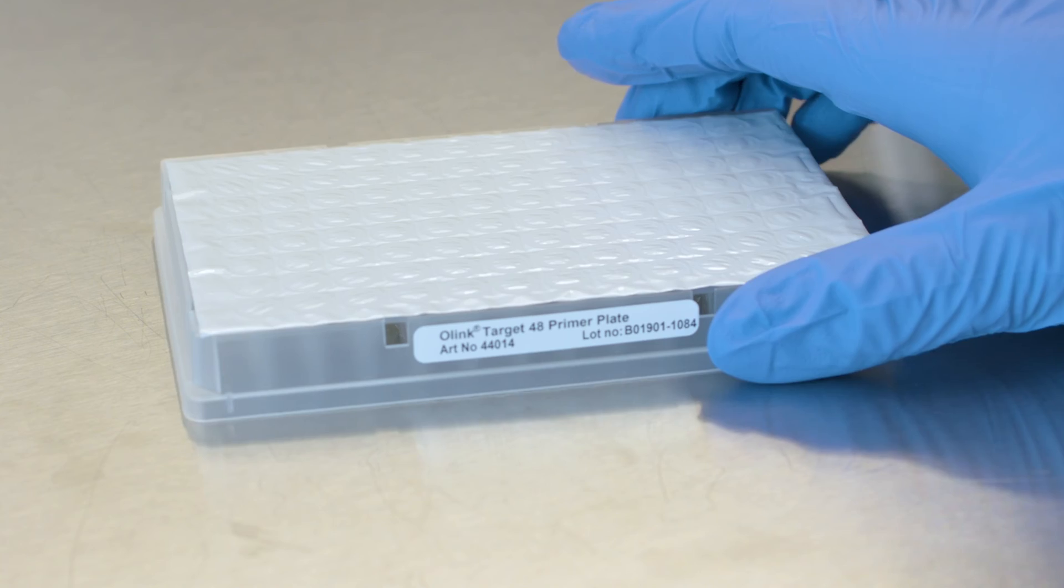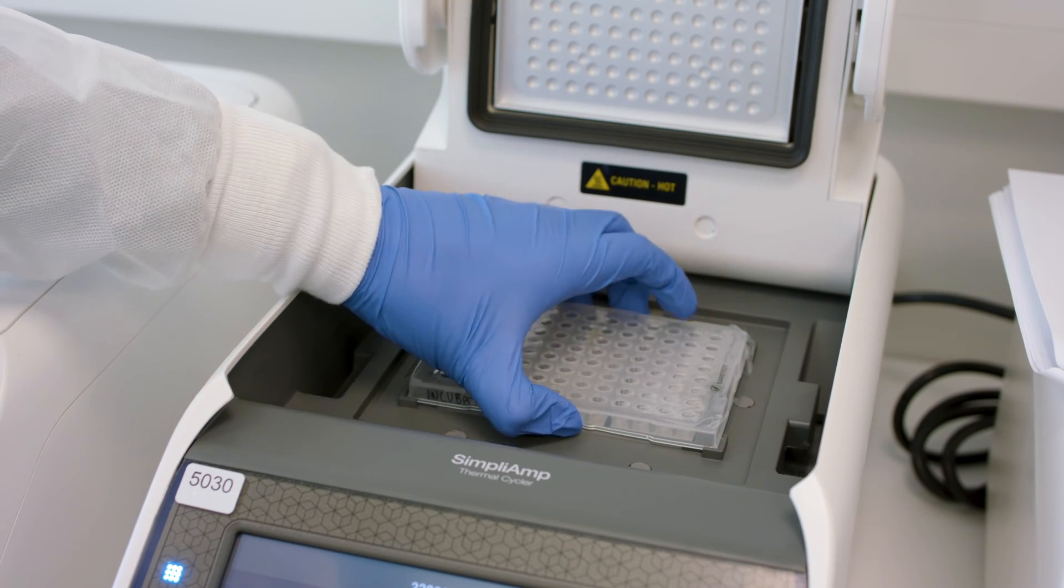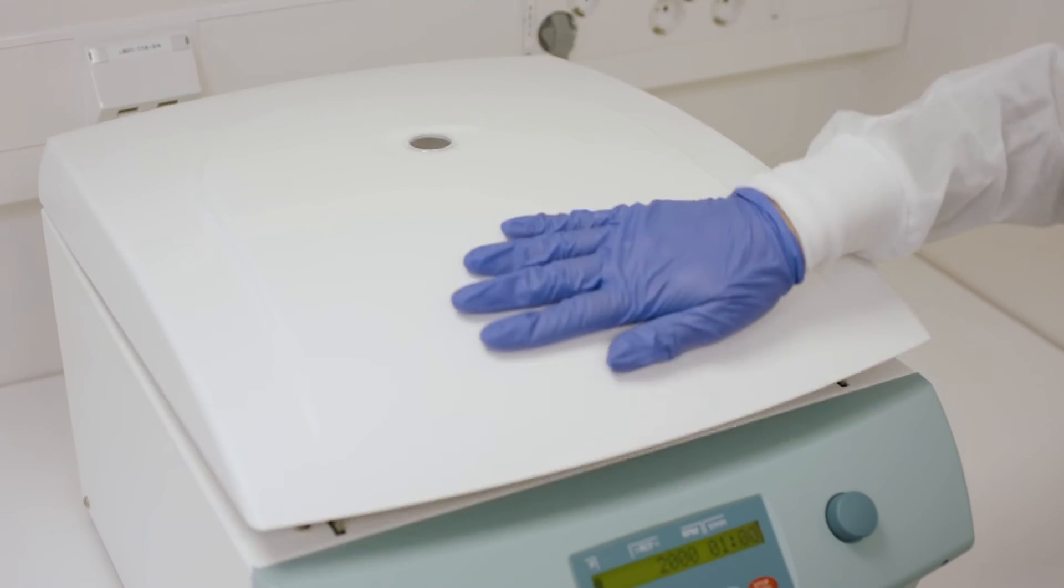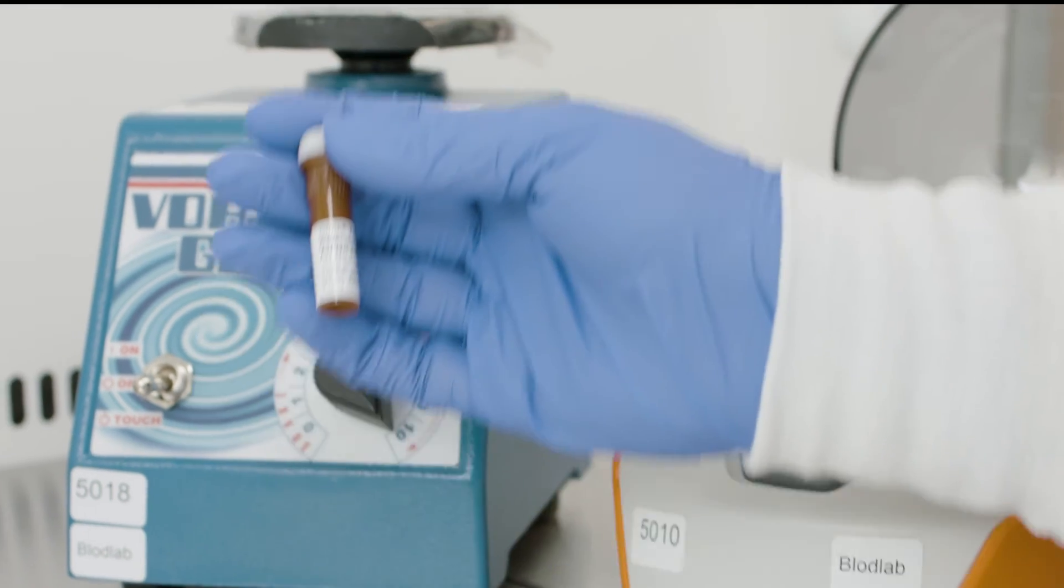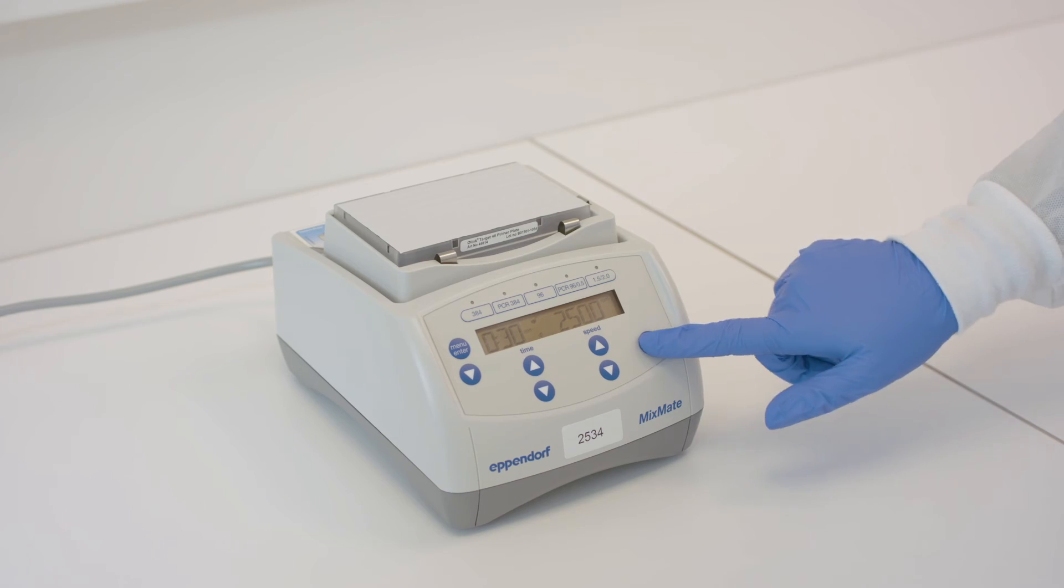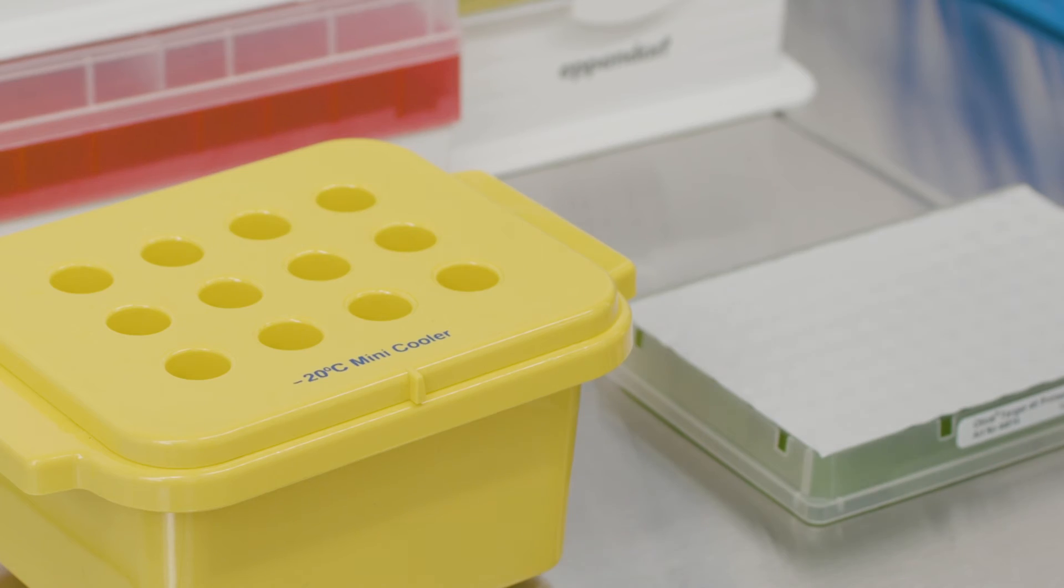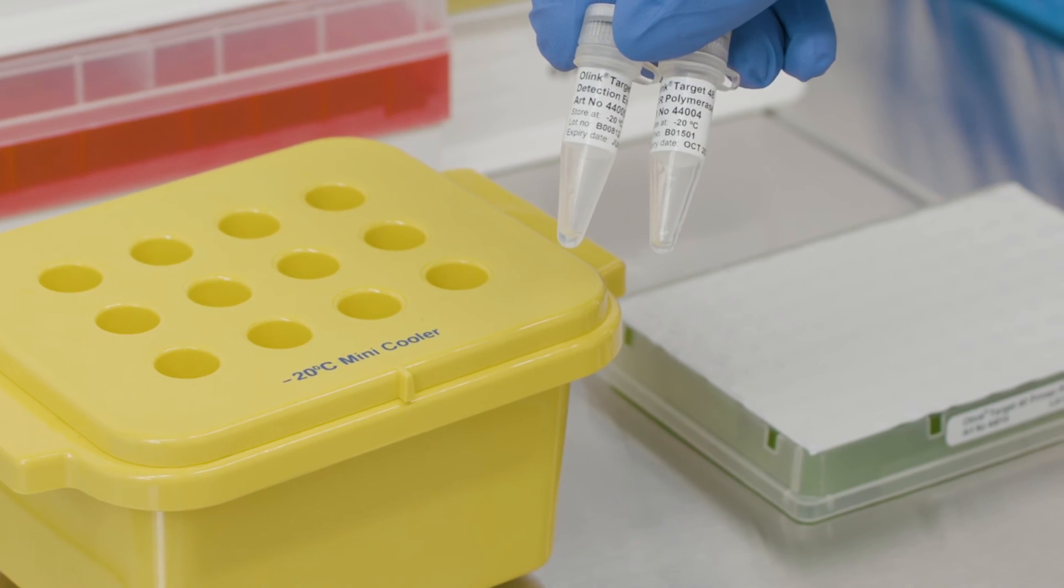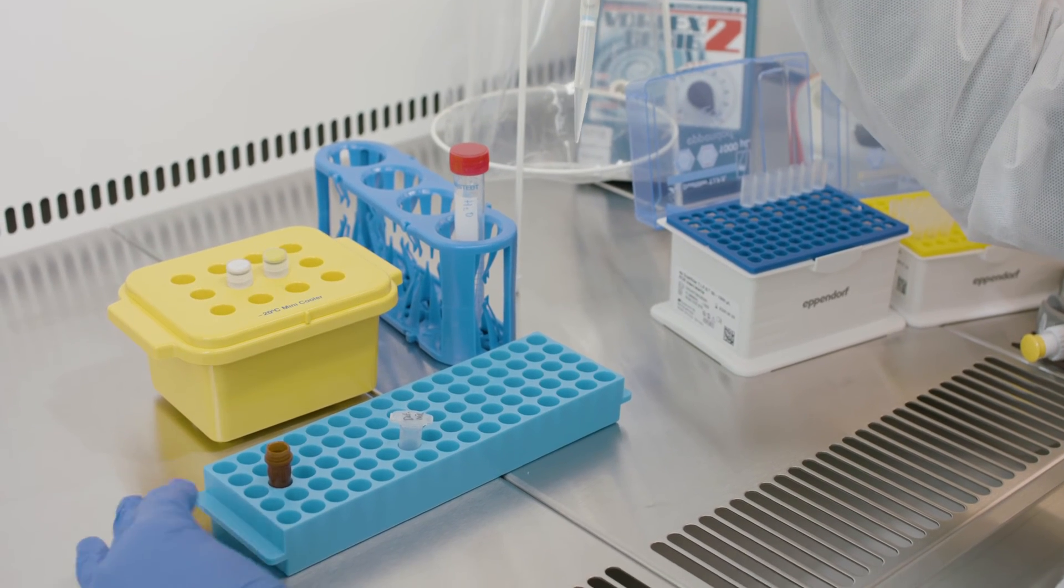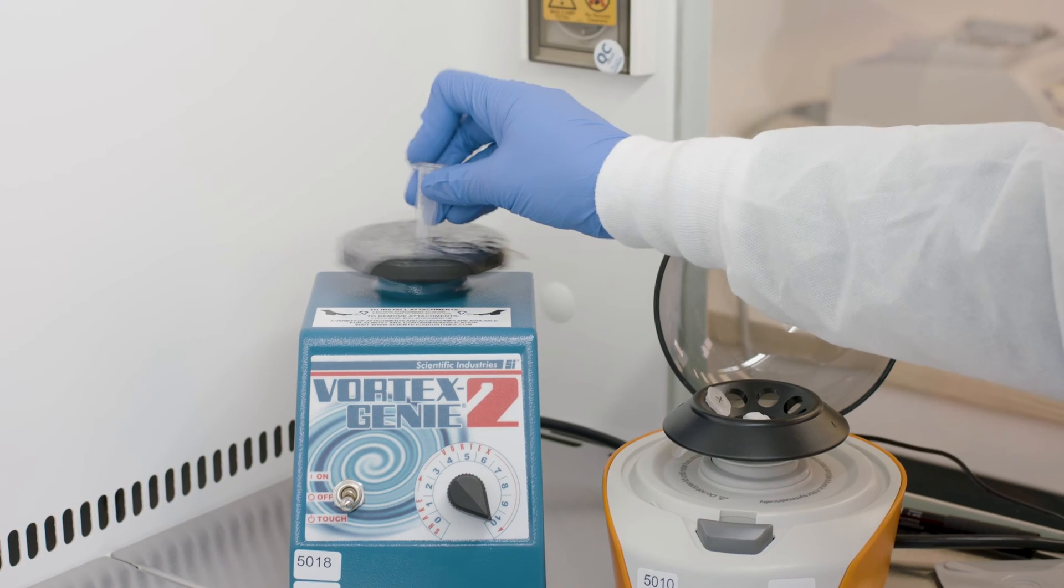Thaw the primer plate. Remove the incubation plate containing the PCR product from the PCR instrument. Vortex and spin down the content. Thaw the detection solution, and vortex and spin down the detection solution and primer plate. Bring out the detection enzyme and PCR polymerase, and remember to place them on a freezing block. And prepare the detection mix in a microcentrifuge tube according to Olink user manual.